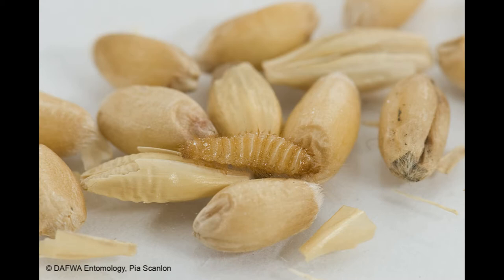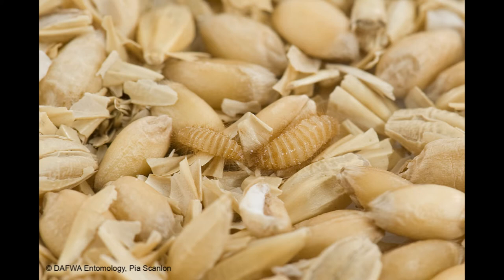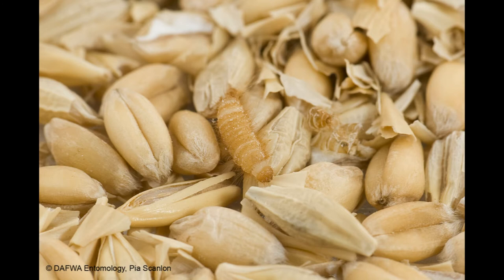Their reliable identification and separation from dozens of very similar-looking dermestidae species is crucial to maintaining a country's area of freedom. When a commodity is infested, the larvae are what is most commonly found. The adults usually only live for a few days and their dead bodies act as a further larval food source. The identification of Trogoderma larvae is less reliable than adult identifications, due to the immature forms having fewer species-specific features, compounded by the many unknown species within the genus Trogoderma.